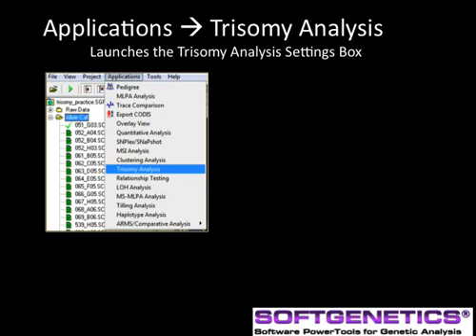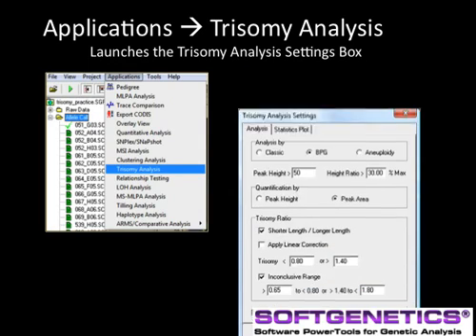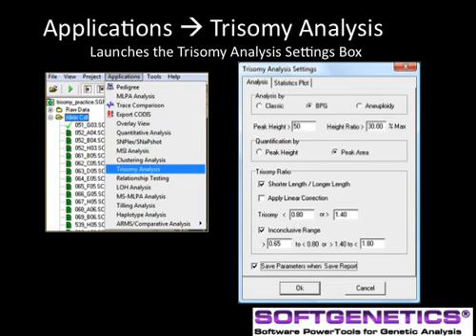After confirming allele calls in the main analysis window, link directly to trisomy analysis from the application's drop-down menu. There is no need to transfer data. The trisomy analysis application is directly linked in GeneMarker. The trisomy analysis settings box includes a tab for analysis settings and statistics plot.